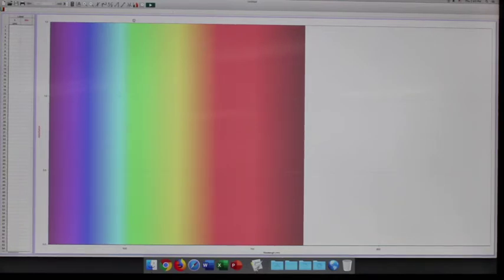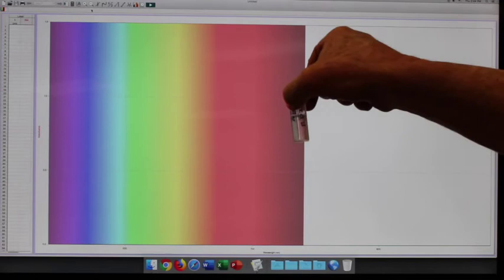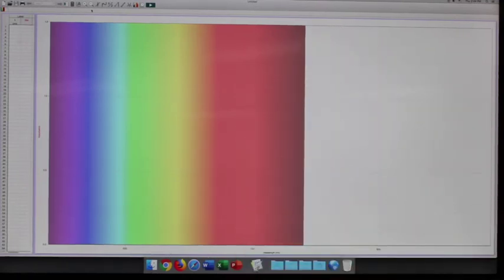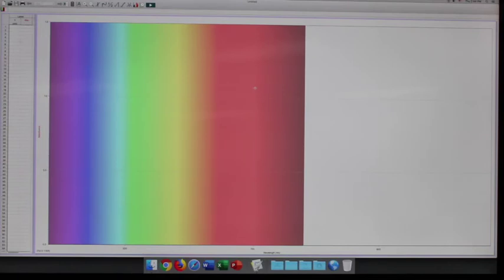Now what we're going to do here is use the spectrometer to measure the absorbance of the light in the solutions from the onion. So to start with, I'm going to take straight water. This is our blank DI water. Place it in the spectrometer. Go up here to experiment, go down to calibrate, and calibrate the spectrometer. Now I already warmed it up, so I can skip the warm up and finish the calibration. It only takes a couple seconds to calibrate. Then I'm going to hit OK down here.